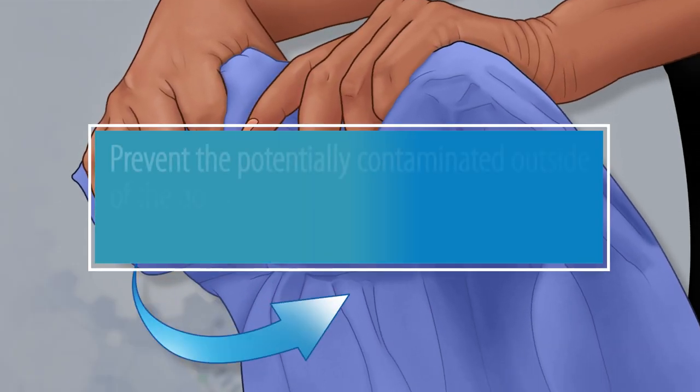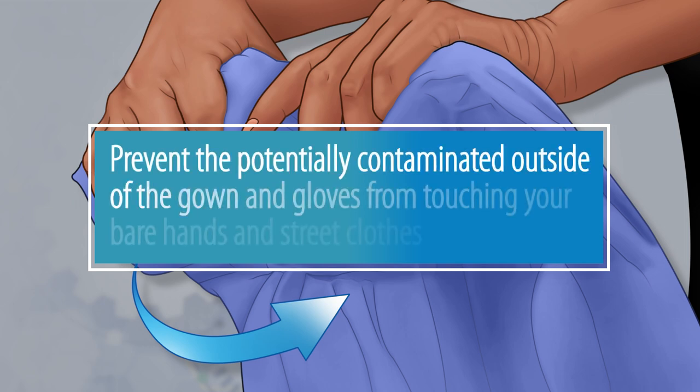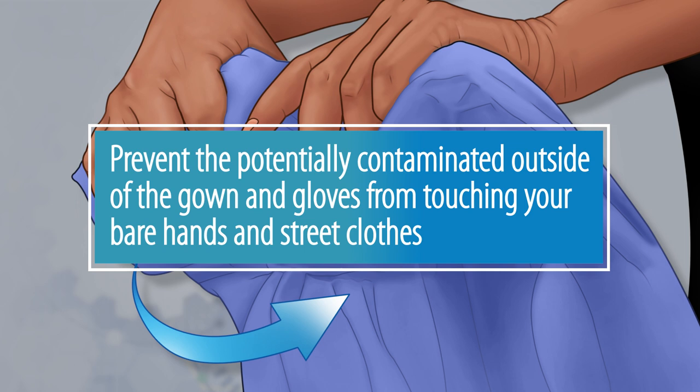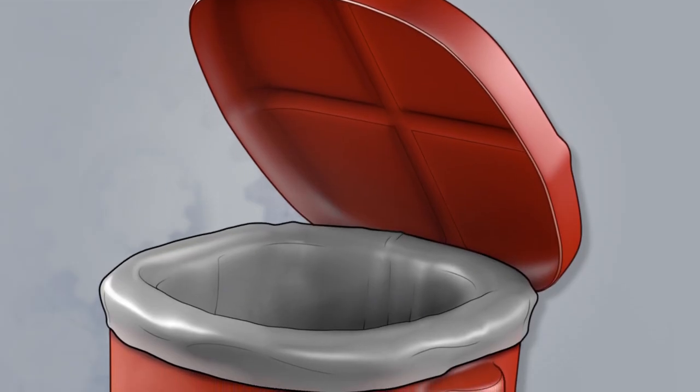Take care to prevent the potentially contaminated outside of the gown and gloves from touching your bare hands and your street clothes. Dispose of the bundle into the biohazard waste container.